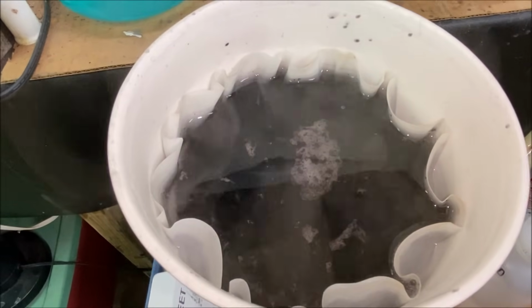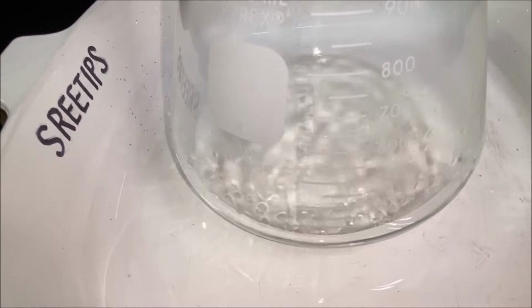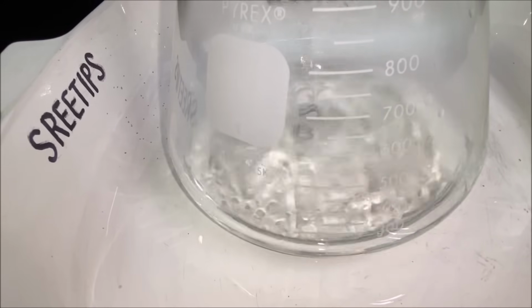Purple is the color of gold. If you look down here, the rinse liquid is colorless, which is what we want to see. That ensures that we've got all the silver rinsed out of here.